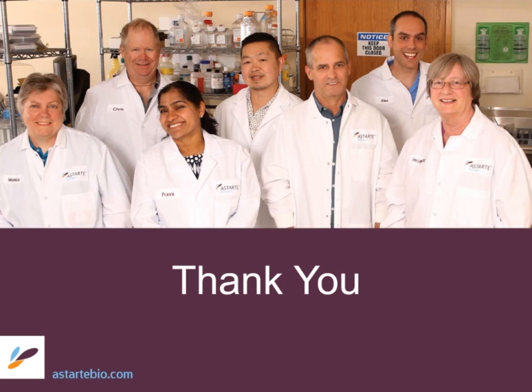Totally. Okay, Jay has another question. They ask, what set of flow panels would you suggest to measure from early to killing? I want to say that they're asking from beginning activation to killing. I think that kind of goes back to your initial question when we were talking about your basic panels, that you would include things like IL-2, interferon gamma, CD95, CD28 to knock out the naive versus all the central and effector memories.